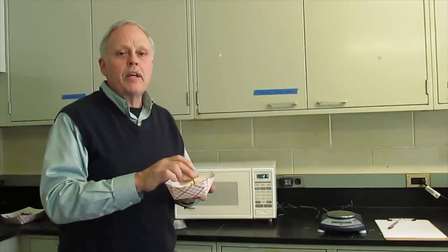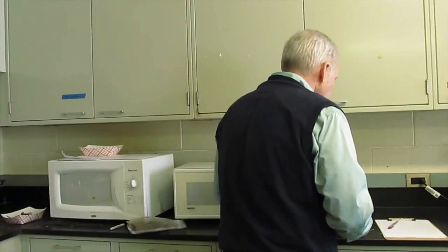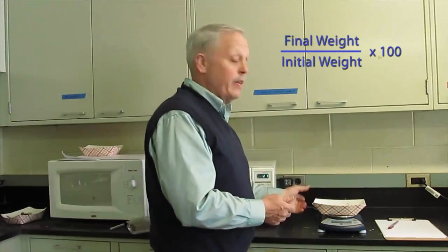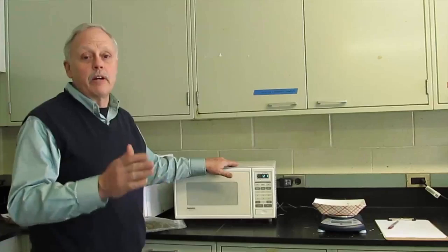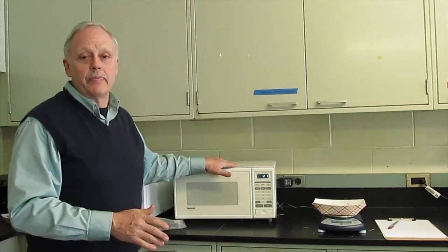When you get the same weight two times in a row — and it can still be hot — record that amount. That gives you your dry matter basis, and then you do the calculation based on what you started with in the sample. One final point: don't put a glass of water in the microwave, as it will be impossible to get the sample down to 0% moisture while water is running in there.